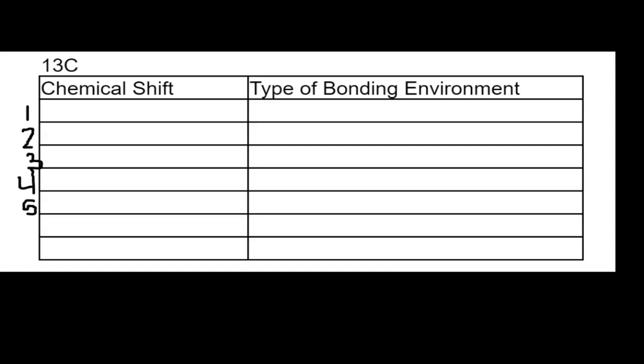For the first one, number 1, I have put 173.61, and that would be sp2, which would be the carbon that is double bonded to the oxygen.